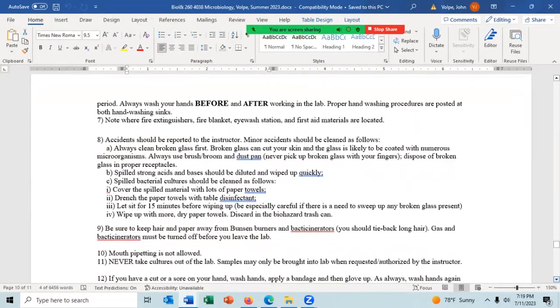When you come into the lab every day, you should put your things in the cubbyhole and then walk into the lab proper, wash your hands at the sink, then go and put on your lab coat, then go and get the gloves and put on the gloves, and then go to your lab station in the lab proper. If you're going to be working with a splash hazard, you may at this time go and get the goggles. Any question about any of that?